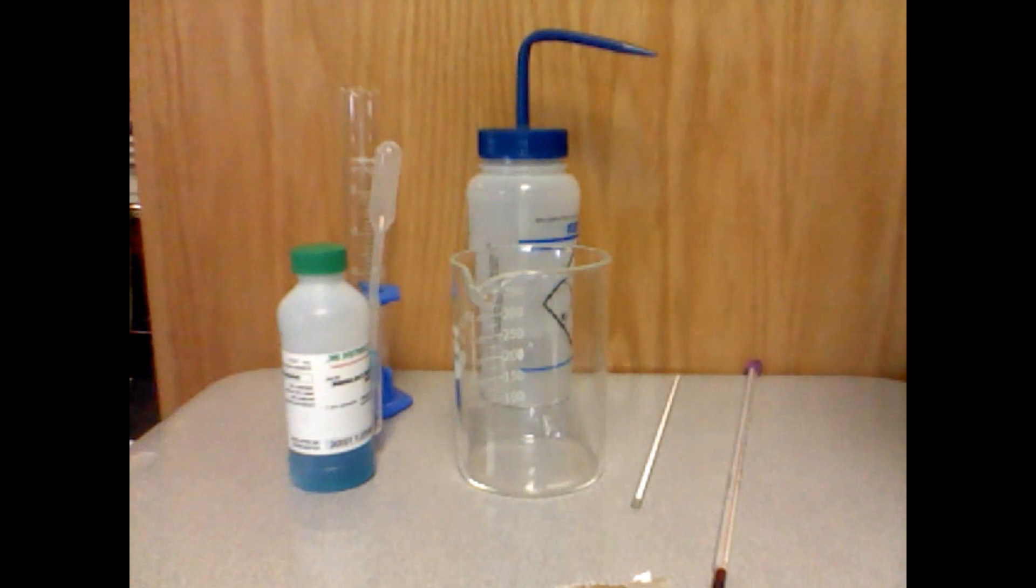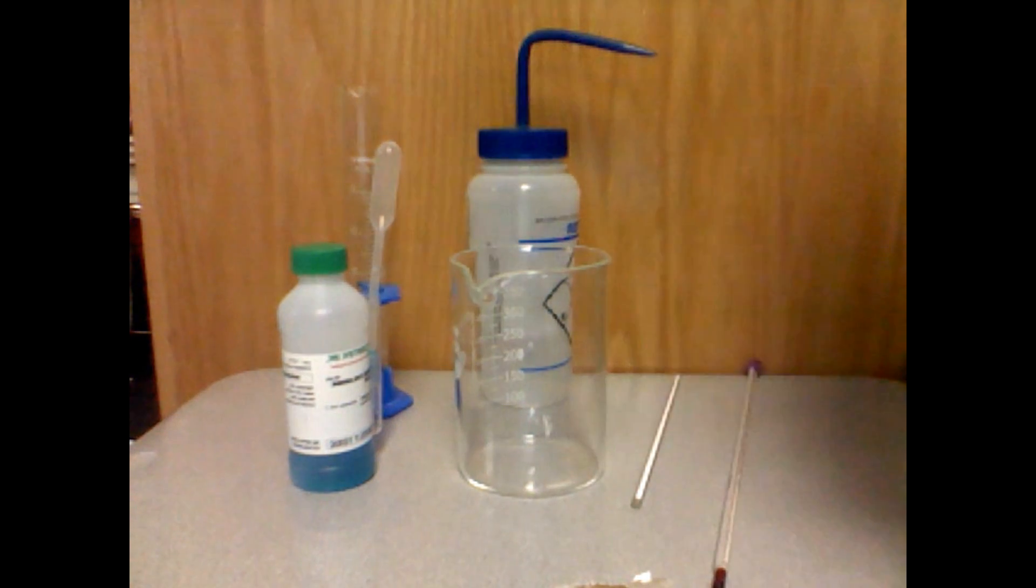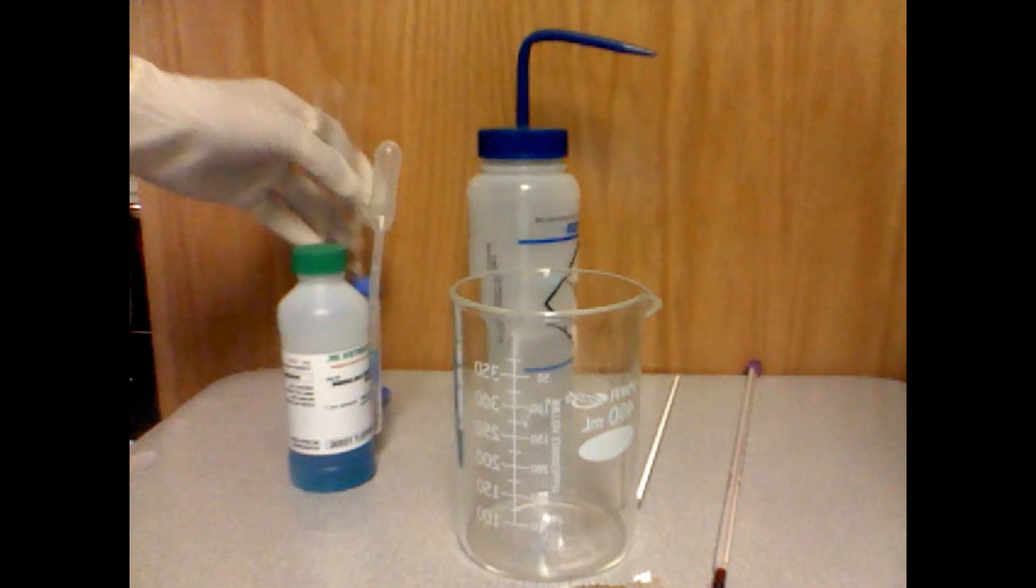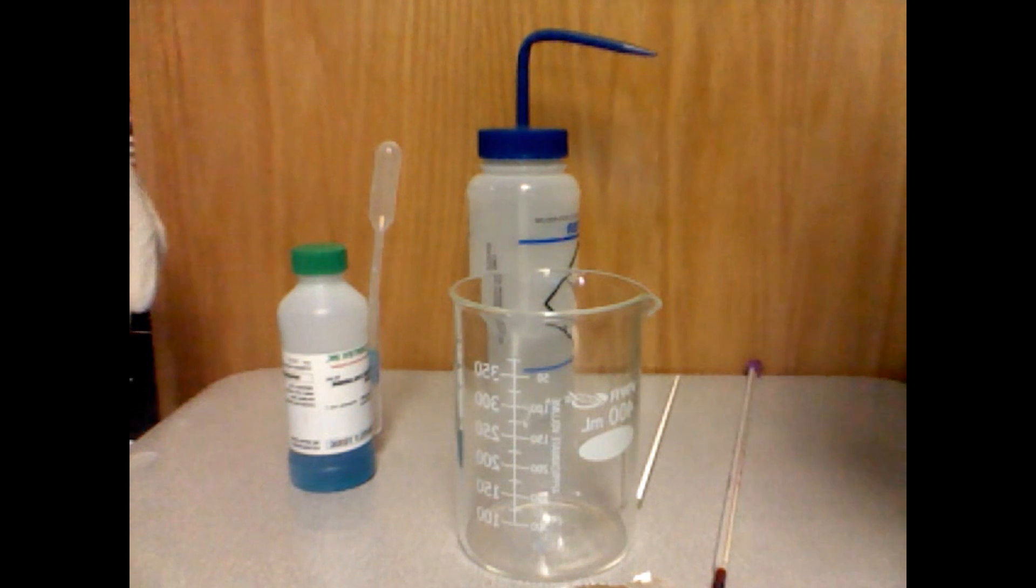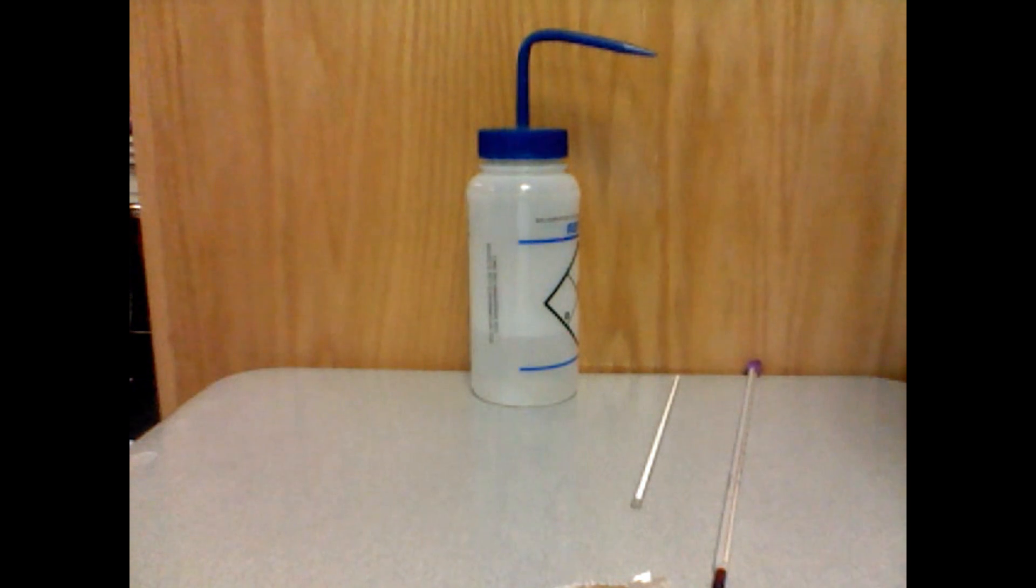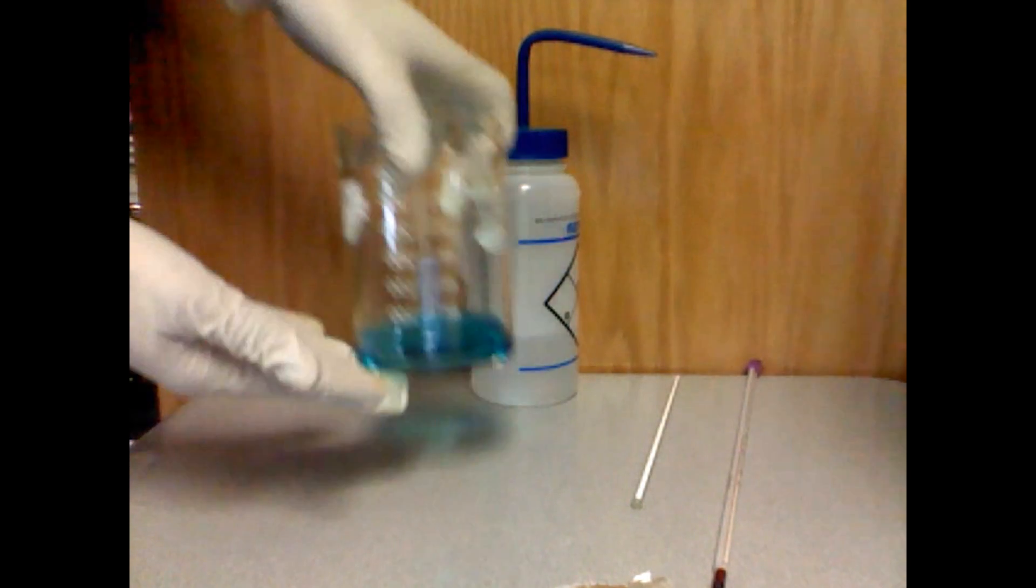Now, to begin this experiment, we must use a 400 milliliter beaker to put our solution in. After we have measured 35 milliliters of the copper(II) chloride solution, we will pour it into the 400 milliliter beaker.